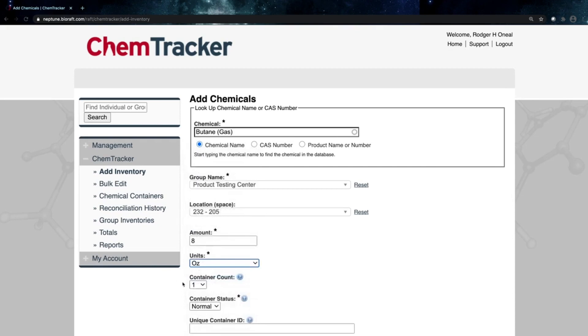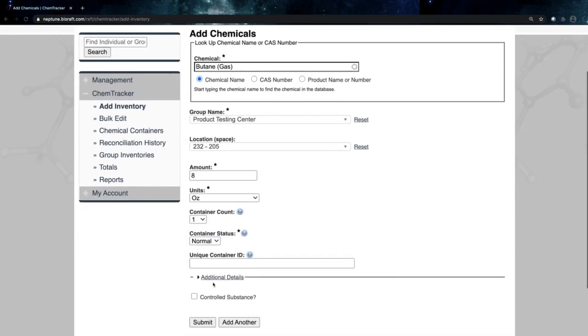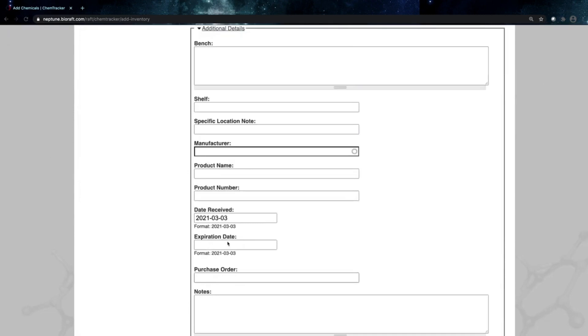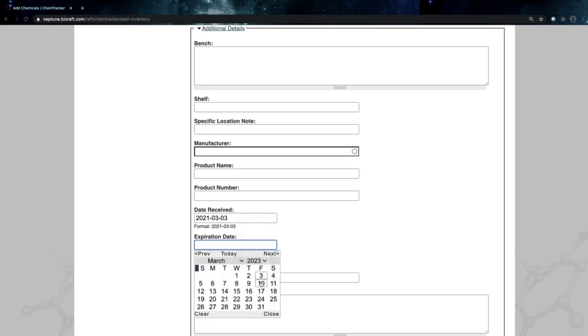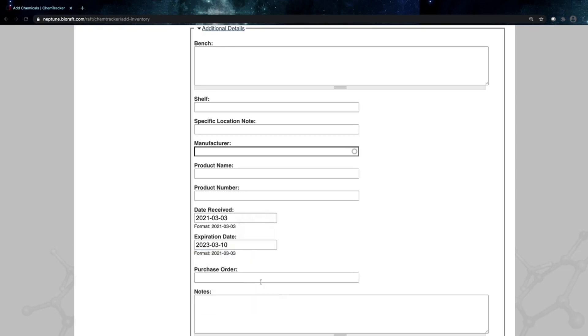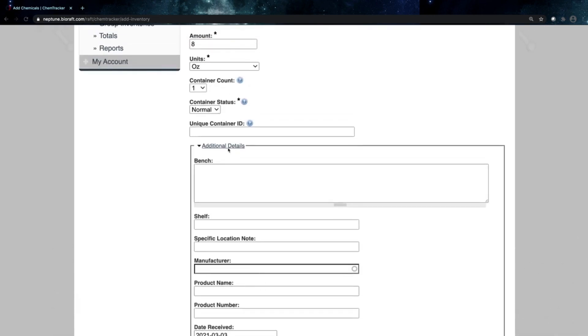We only have one container of butane. Now I could enter additional details if I wanted to, any more specifics about where this container is stored. Maybe we'll enter an expiration date here, for example. And let's go ahead and add that barcode number.